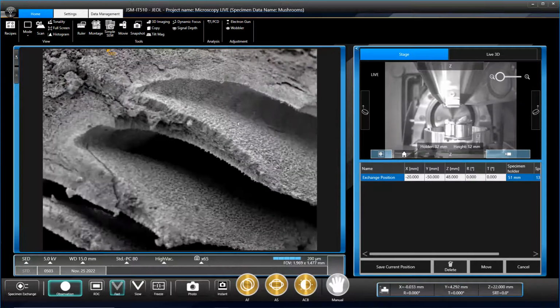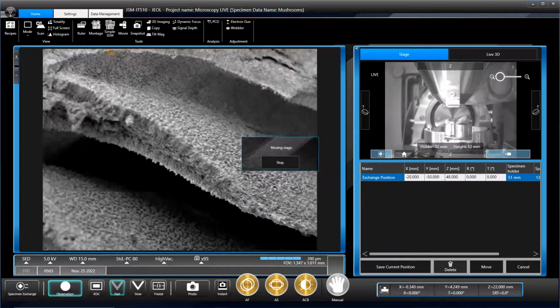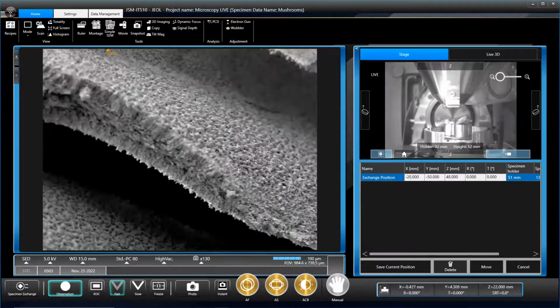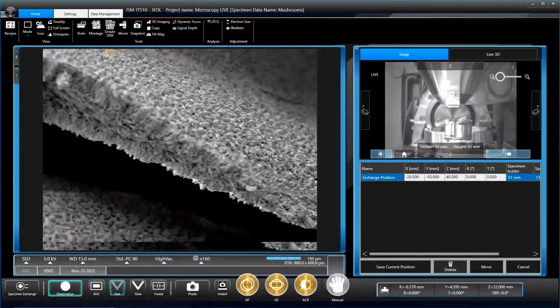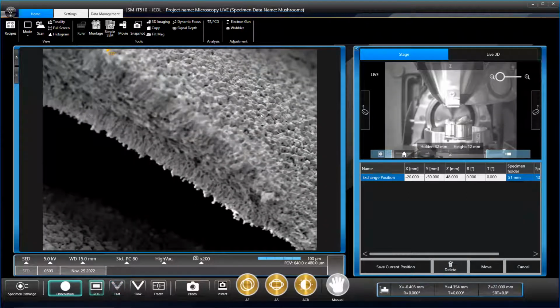Same family as the oyster mushrooms, the Pleurotus. I think it's a eryngii technically. I'm not entirely sure. But you'll see this advertised as king oysters or king trumpet mushrooms. They look like they've got a little cap and then a big chunky body.